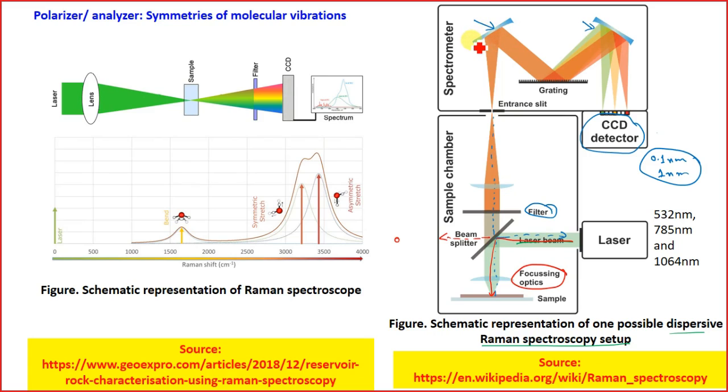If you remember correctly, during our UV spectrophotometric analysis, we said that these mirrors are aluminized at the front. The glass may have absorbed something, but since you are aluminizing the glass on the top, it is reflecting all the light.